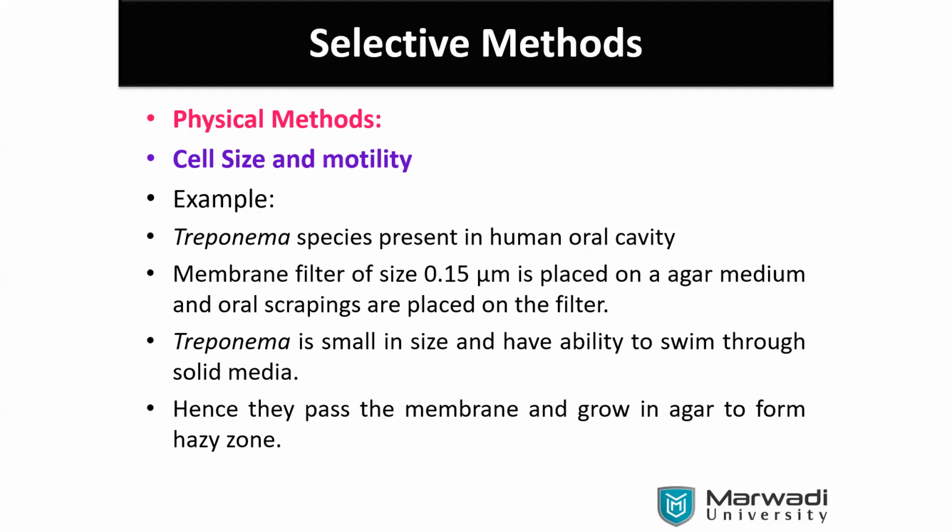Hanging drop method to check the motility of the cell. So here also cell size and motility. Majorly motility is caused by flagella, but some have pili-like structures, small tentacle-like parts. Maybe you have learned the flagella structures: mono, di, tri, many, polytrichous flagella. They are for the motility, so we just have to check whether the cell has such parts or not.